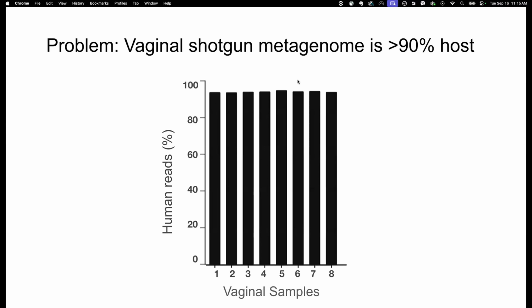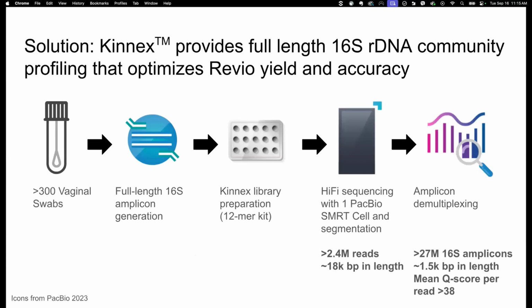So that's a fine question, but a difficult one to answer using tried and true shotgun metagenomic techniques. It turns out when you just sequence the DNA coming from these vaginal swabs en masse, this is what it looks like. For each of the 8 samples I'm showing you here, the y-axis shows the percentage of reads that map to the host, right? So these are really dominated by host, which makes it very challenging to look at the microbial communities.